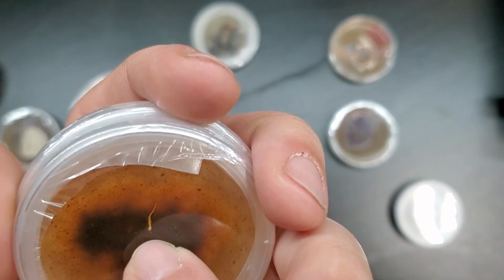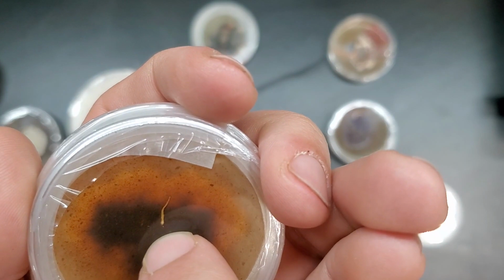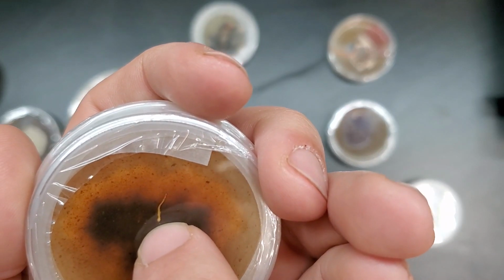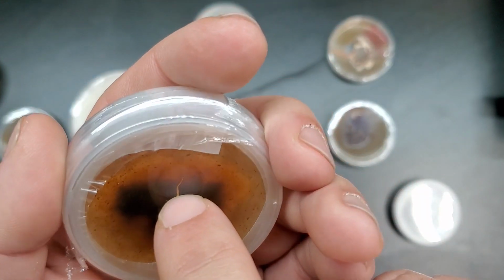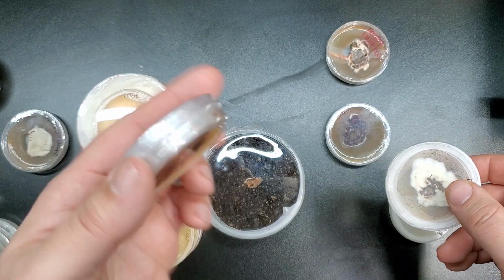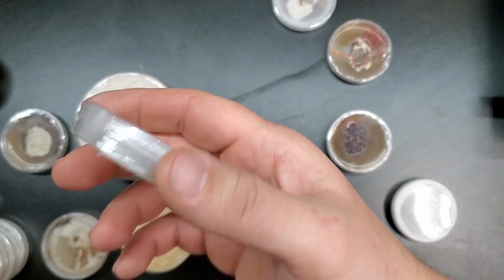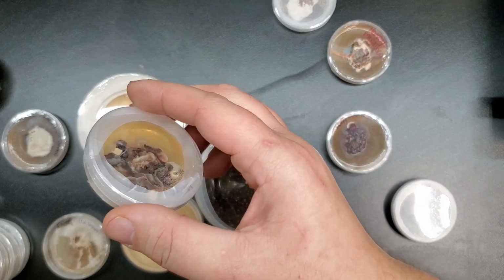I just realized this. You can see right there that this one put off a rhizomorph, which is basically just a really thick string of mycelium that looks a lot like a plant root. And this one actually put a relatively thin one down through the center, and it's hit the bottom of the Petri dish. So it looks like this one is starting to do what this guy did. So that's pretty cool. I think I'm going to be doing some experiments with this one just because the genetics are so good. The genetics for this one seem to really like the agar that this is growing on. I'll be doing something with this in the future.